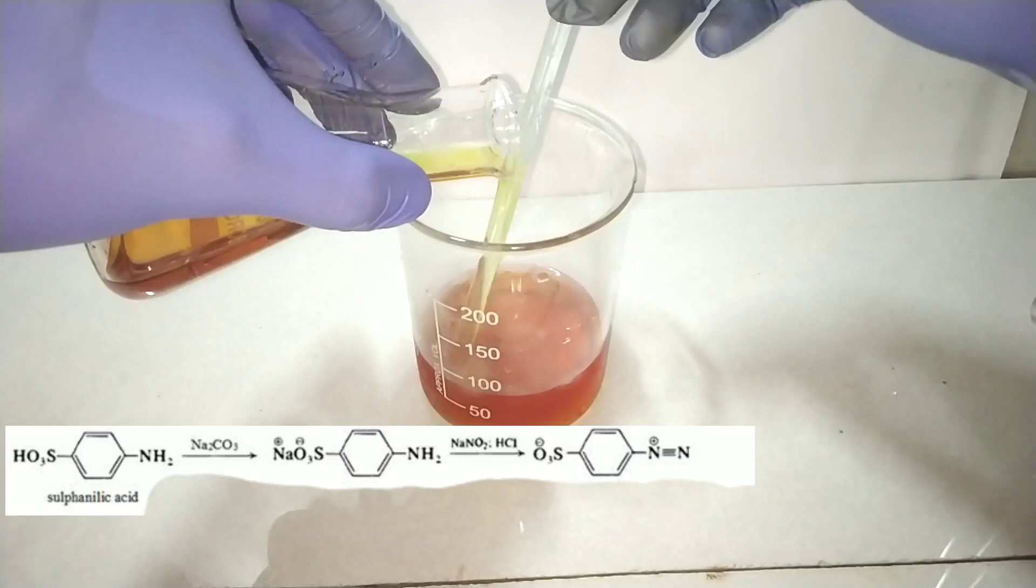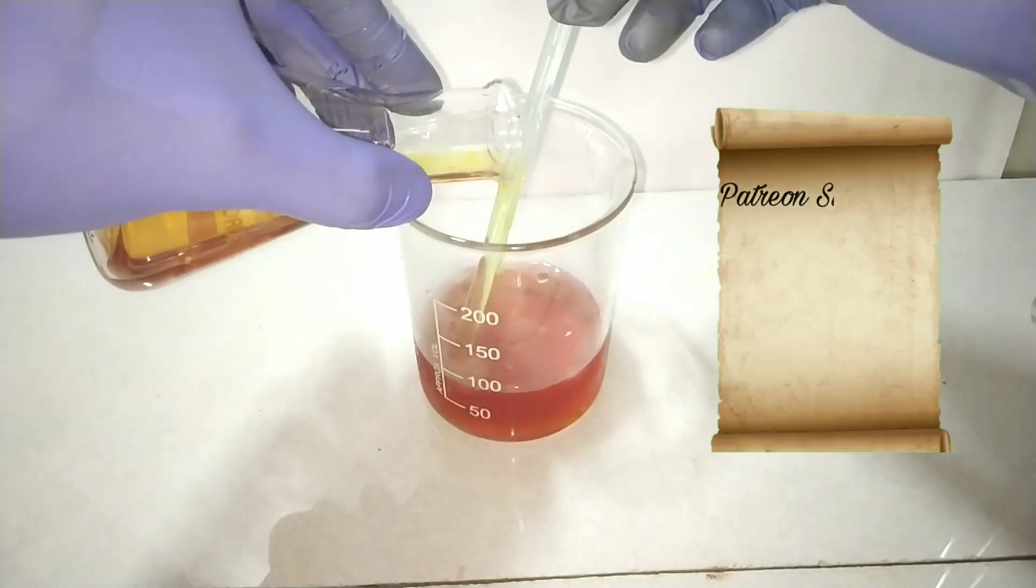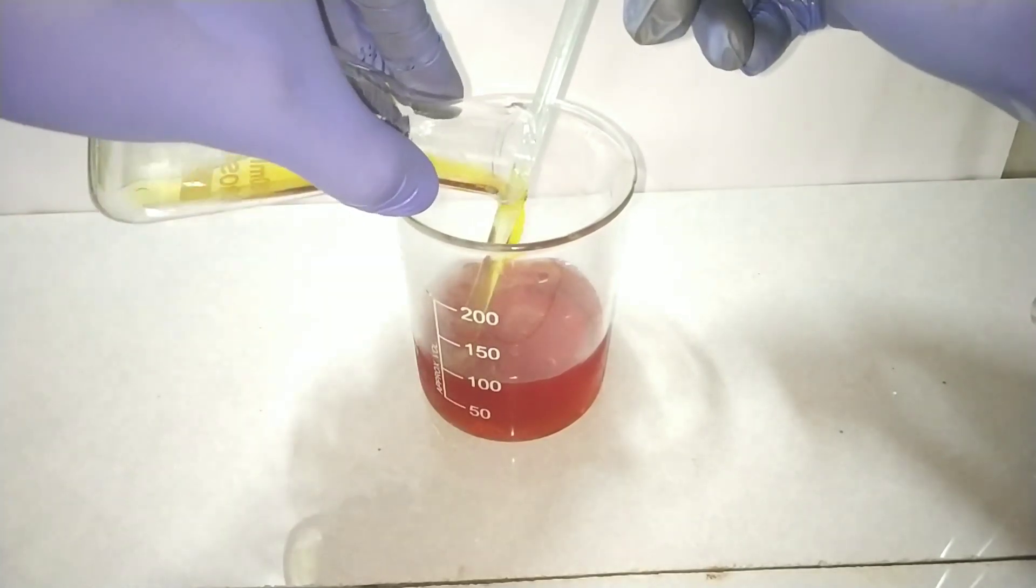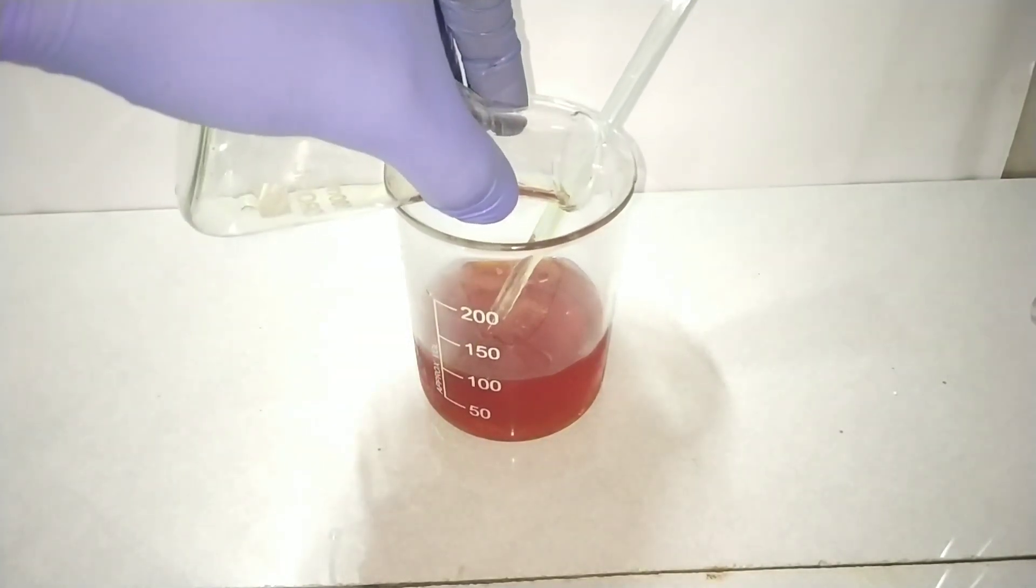This completes the diazotization of sulfanilic acid, and the diazonium chloride then ionizes in aqueous solution to form the sodium ion, chloride ion, and the internal salt.